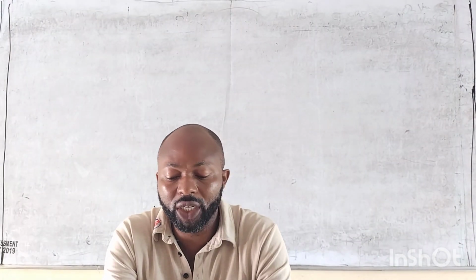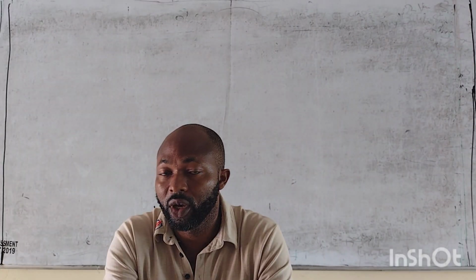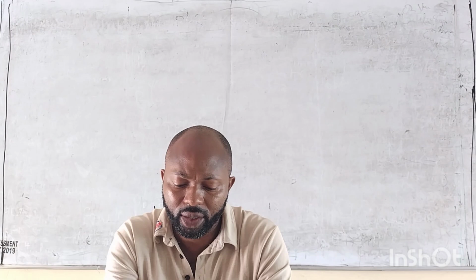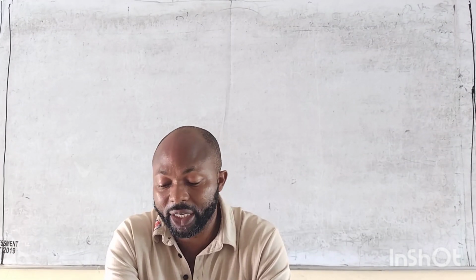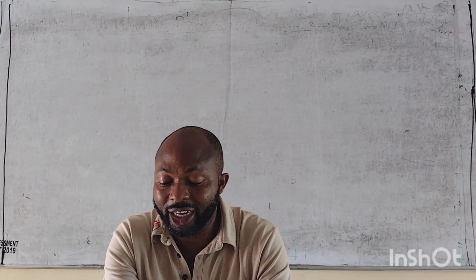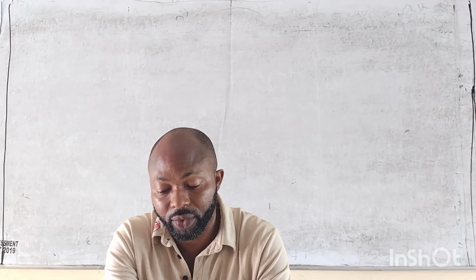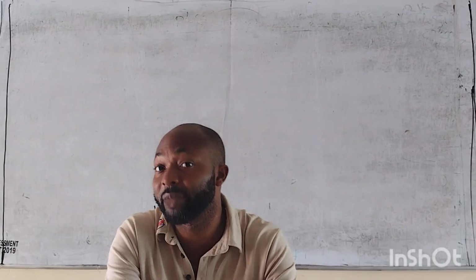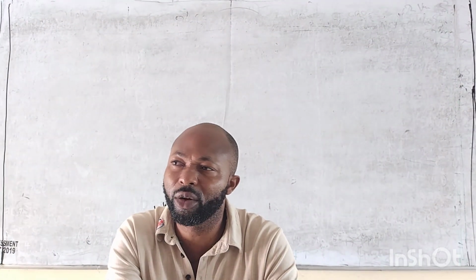Today we'll be dealing with qualitative organic analysis, like we did in the previous class was qualitative inorganic analysis. Today is organic. So qualitative organic analysis is an aspect of practical chemistry that is concerned with the identification of various elements and functional groups present in organic compounds. In this one we identify certain elements and majorly their functional groups. The functional group defines the compound.